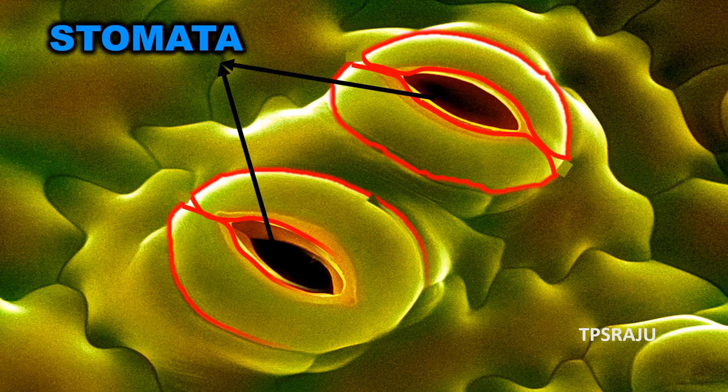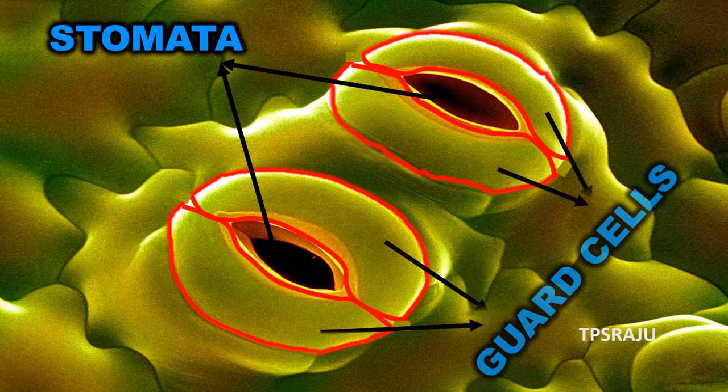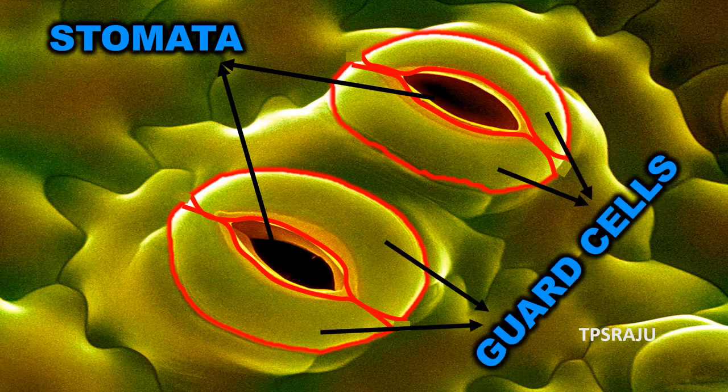Each stoma is enclosed by two kidney-shaped cells called guard cells. Let us observe stomata in beetle leaf.